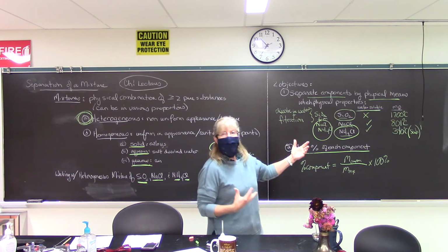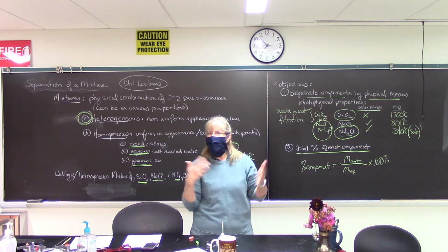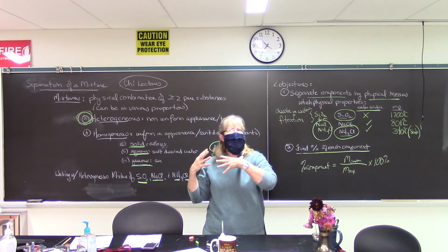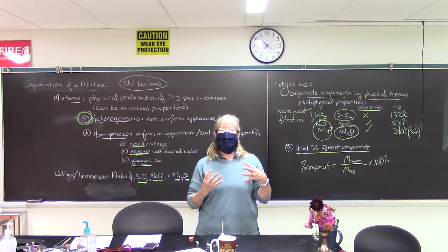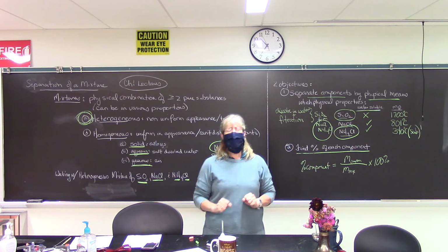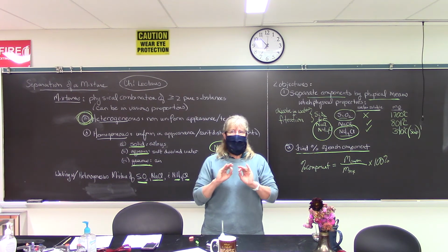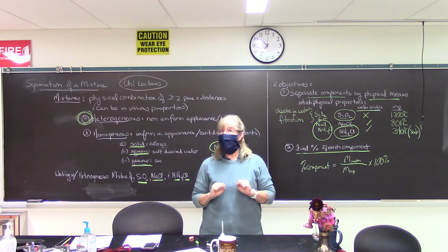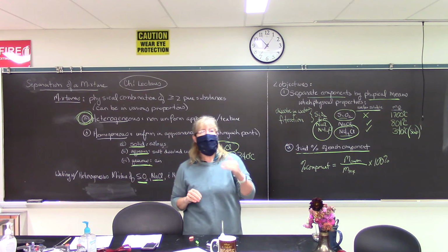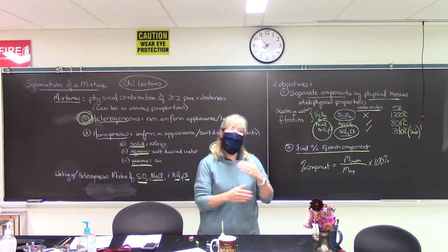It's going to be in water, so you see some vapor from water and very diluted ammonium chloride. It's not going to come across as obvious and as striking as it will if you sublime it first. So you could do it the other way, but it gets much more complicated, and we really want you to see sublimation.